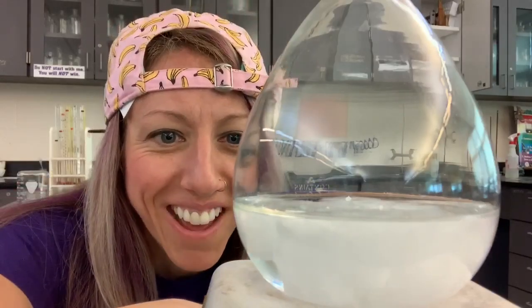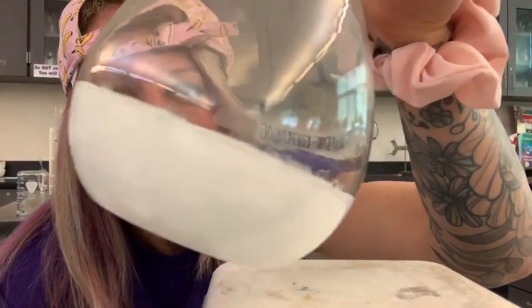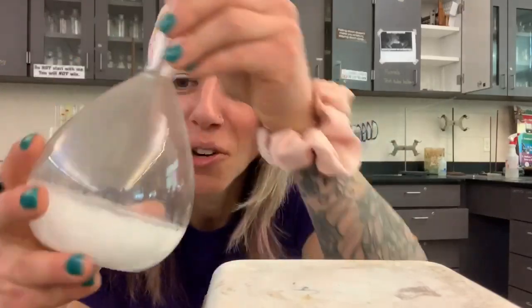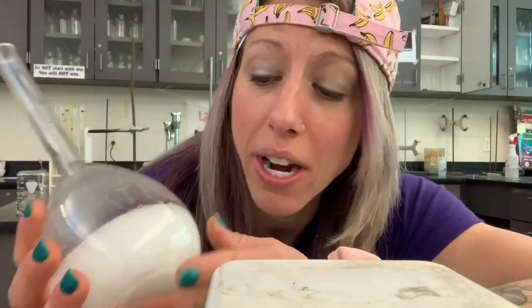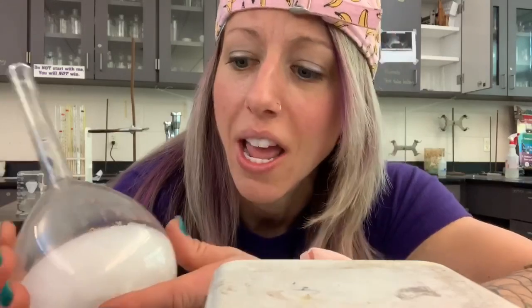Oh yeah, look at that — I did it for the first time! As you can see, it turned to a complete solid in there. This is very exciting, especially for my current students who remember me telling you about how I've never been able to do this before. It's very exothermic, which means it gives off heat. This was room temperature when I started, and now it's actually warm to the touch. We call this demo 'hot ice.' There it is!